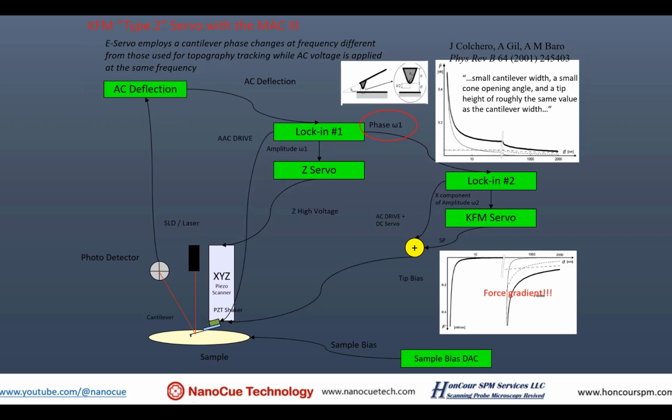I know with one of the techniques that I use here in the lab, XPS, you put anything in there and you're always going to have the adventitious carbon on the sample, and you use that as a reference for your charge compensation correction. Yeah, surprisingly, if you keep annealed gold in DI water, it will maintain its cleanness for a much, much longer time.